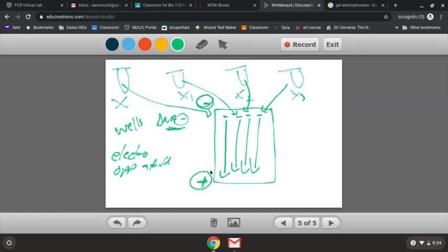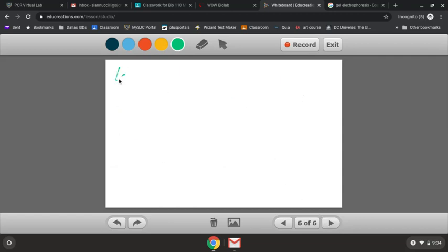So you might be saying, Professor, how is this going to help me find out who's alike and who's different? Well, the reason for that is larger pieces of DNA move slower than smaller pieces. That first suspect had 4 pieces of DNA of varying lengths. The biggest piece is going to move slower than the smallest piece. So this is going to move slow because it's so big.